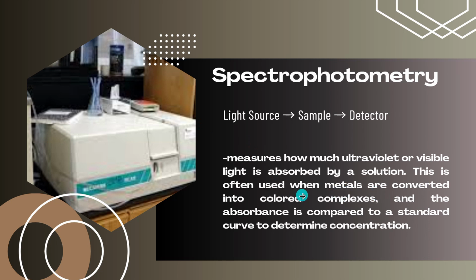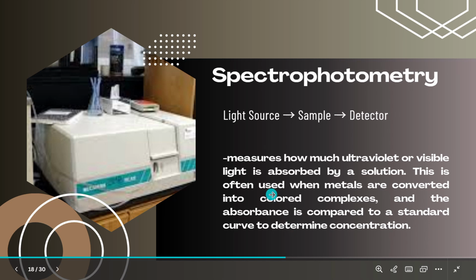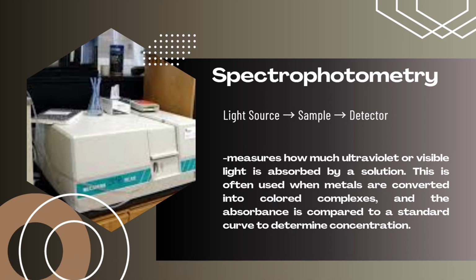This is often used when metals are converted into colored complexes and absorbance is compared to a standard curve to determine concentration.